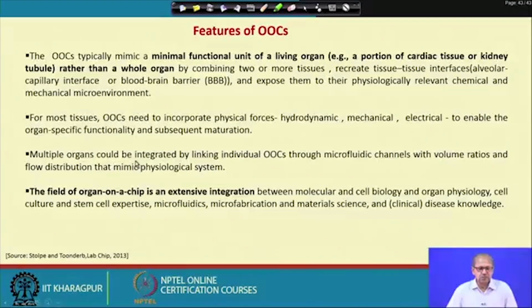Multiple organs could be integrated by linking individual organ on chips through a microfluidic channel or through porous membranes. And most importantly, organ on chip is highly multidisciplinary work. It is an extensive integration between molecular biology, cell biology, organ physiology, cell culture, stem cell expertise, microfluidics, microfabrication, material science, and after all that, clinical disease knowledge, means physicians or clinicians should be involved to really develop organ on chips.